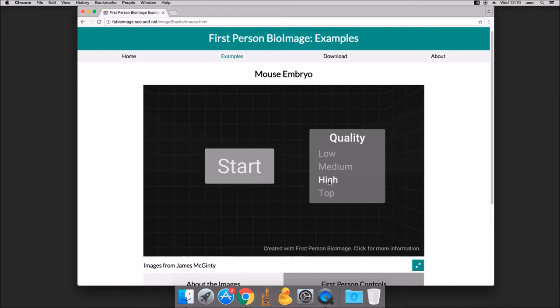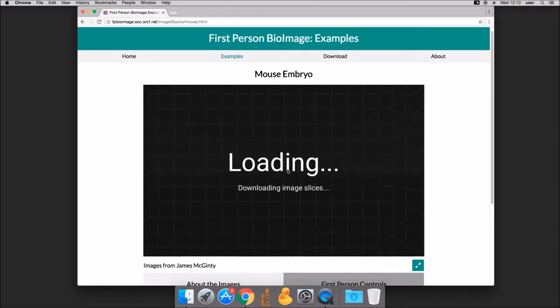Choose an appropriate quality setting for your computer, then click Start. This will load the 3D data into the viewer.